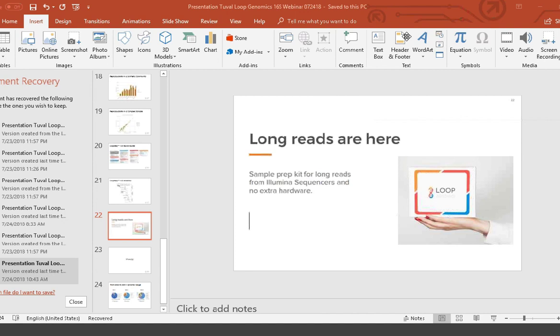Moving on to the next question. Can you share an example informatics report of the data produced from known and unknown samples? Yeah, definitely. First of all, I can show some of that now. Also, if you go onto our website, and I can share those links later, there is a place where you can download an example report of both our long-read FASTQ files and of a CSV file that summarizes the downstream analysis of the long-read FASTQ file. That includes classification information and quantification information. So that can be downloaded from our website, but I'll also run you through parts of that report in a few minutes, because running through the entire report will take too much time now.